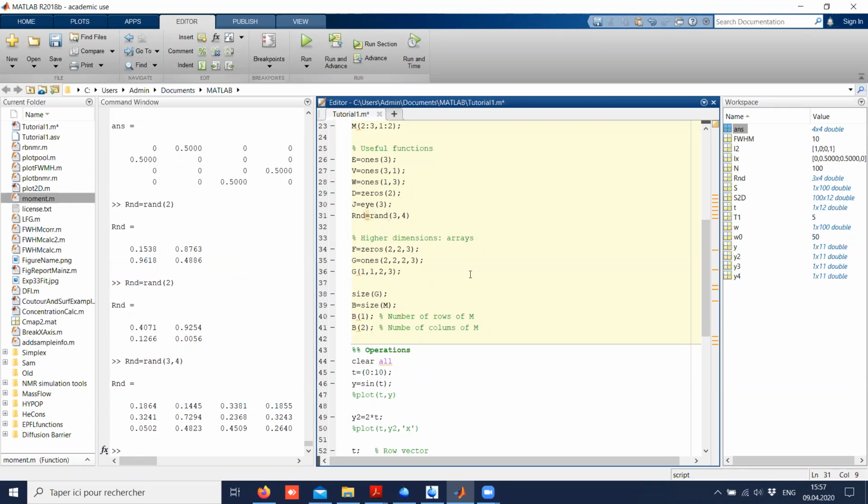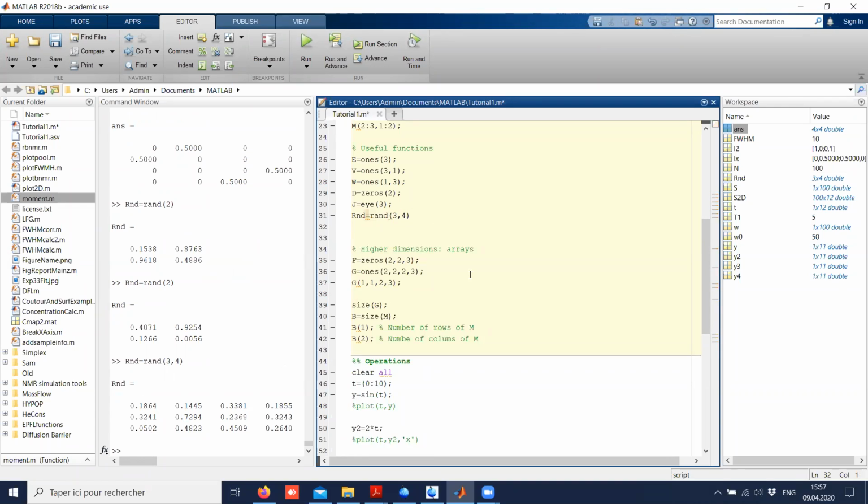There are other ones like, for example, normrnd, I've discovered recently. So here it tells me how it works. It will be centered around mu. There was a dispersity sigma. So if I want it to be around 0 with dispersity 0.1, for example, this will return a single number, I think.